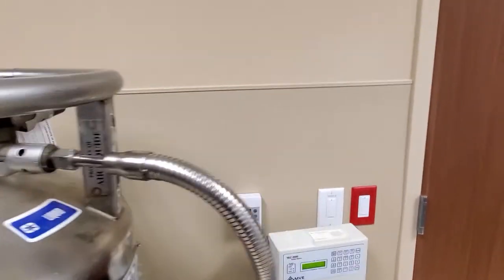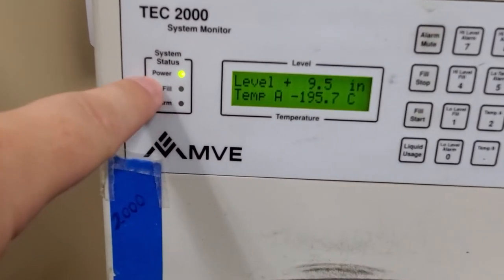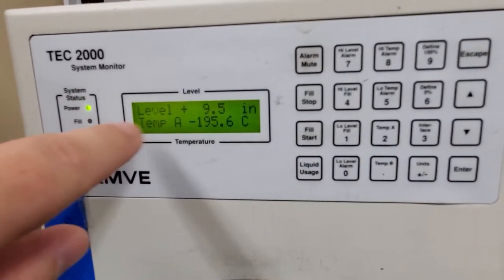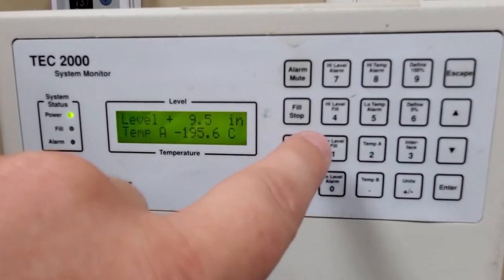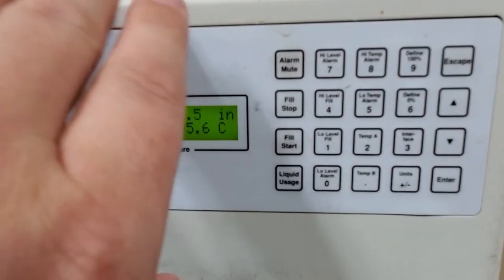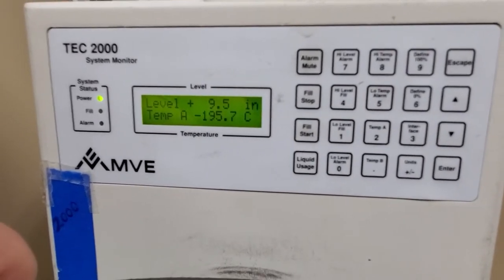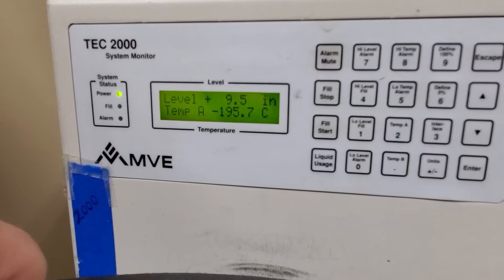Sometimes these units will have an alarm condition. You can see that we have a fill alarm and some control buttons over here. If this is flashing fill and alarm, you come over here and hit fill start. It's going to automatically dispense a certain amount of liquid nitrogen into the freezer. You have a fill stop, but you don't have to press that — it will time out itself when it gets up to a certain level. You can see here we have 9.5 inches of liquid nitrogen currently in this freezer. These units don't boil off quite so quickly; it will normally go through about one to two inches of liquid nitrogen per day, as long as the covers are left on.